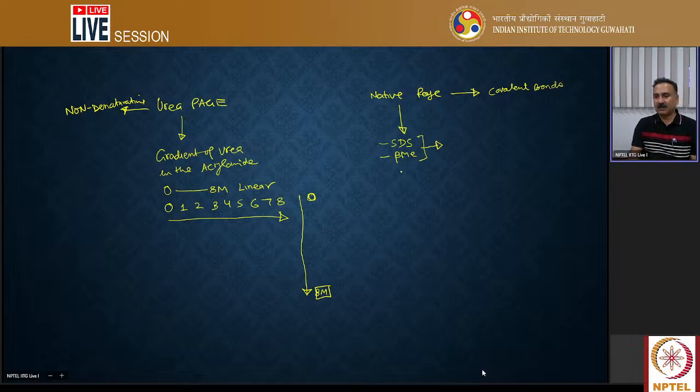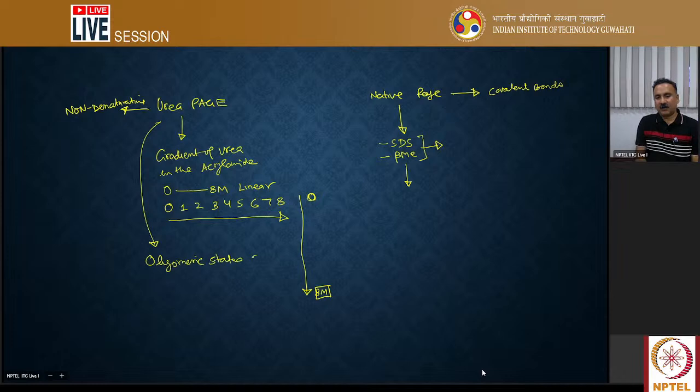With the help of the urea page, you will be able to determine the oligomeric status of the protein, for one.